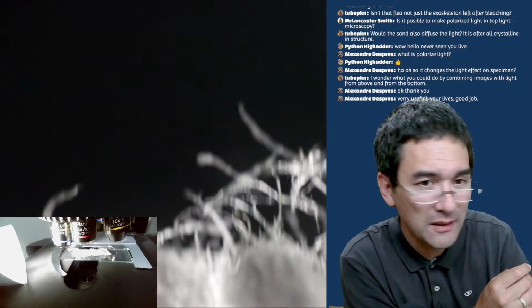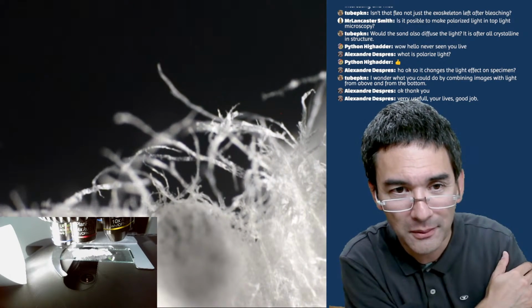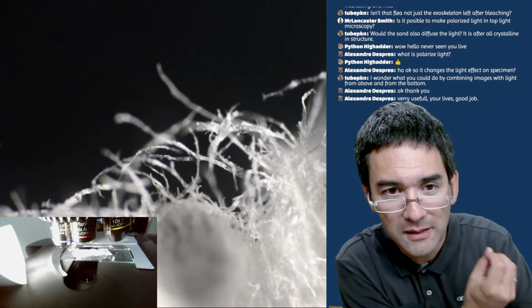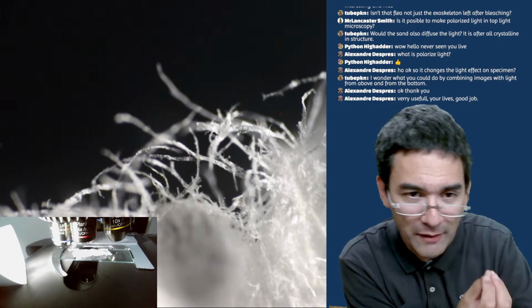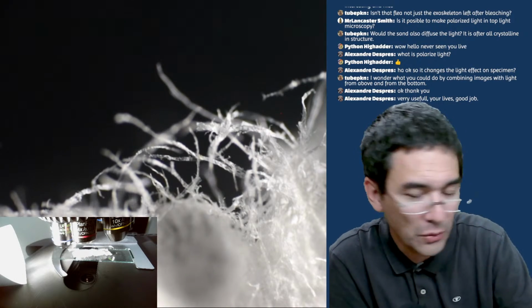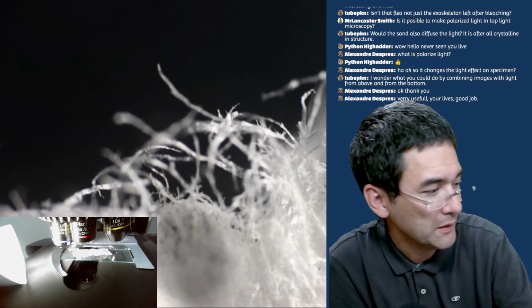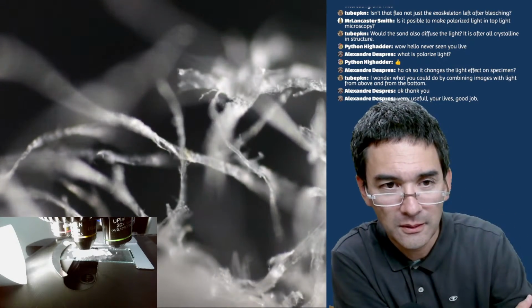So these are basically the cellulose fibers of the paper. And that actually makes it absorbent because the water travels along those fibers and is absorbed this way, and therefore, of course, tissue paper is absorbent. So 4 times, go up to 10 times here.